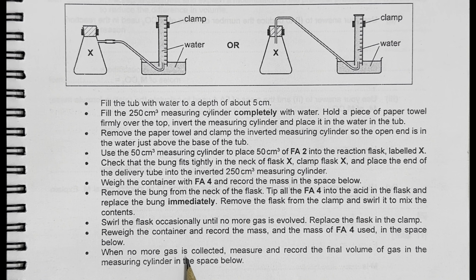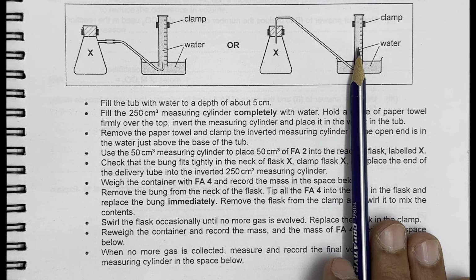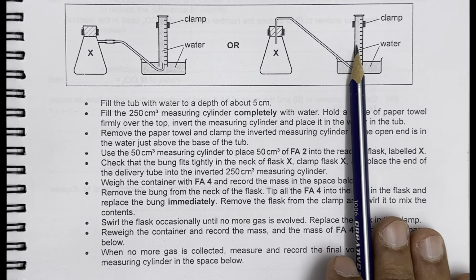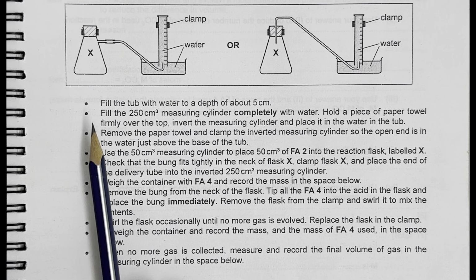When no more gas is collected, measure and record the final volume of gas in the measuring cylinder in the space below. It means after filling this with water, when the gas will go here, so the water will go down and the gas will be collected from the top. And we have to record wherever the reading is, how much the gas collected here is. So let's start the steps one by one.